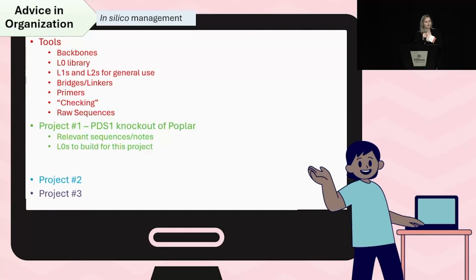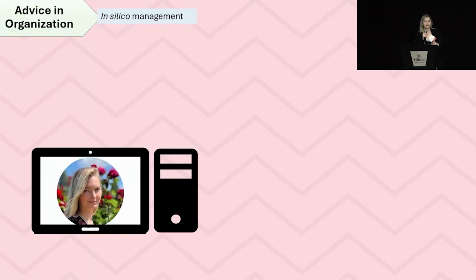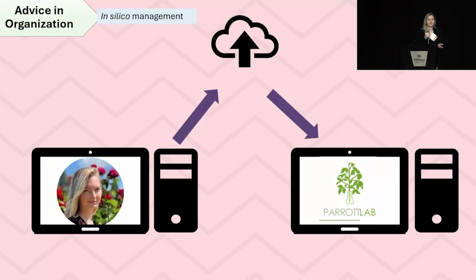And then, of course, under each project, I'll have the notes for it, the level 0s and the level 1s, and the final plasmid. So this is personal to each person, but what's really important to know is that everything that I make, I upload to the cloud, or another platform where everyone in your lab would access it would be just as well. The important thing is that we want to make sure that everyone in our lab would be able to access anything that I make.